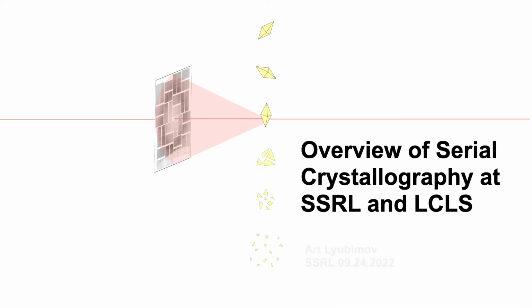Hi, my name is Artem Lyubimov. I am a staff scientist at the Macromolecular Crystallography Group at the Stanford Synchrotron Radiation Light Source, and this is an overview of serial crystallography at SSRL and LCLS, outlining the techniques, devices, and instruments that we provide to our users.